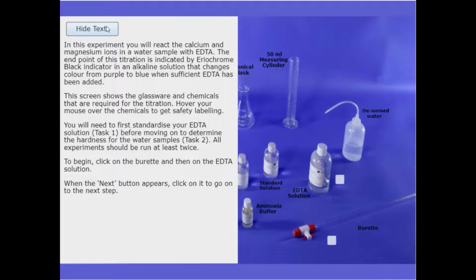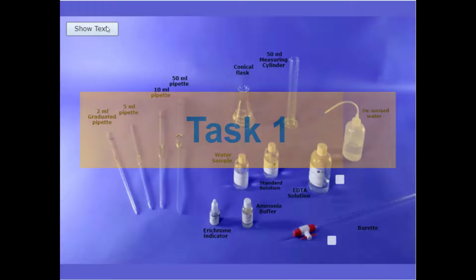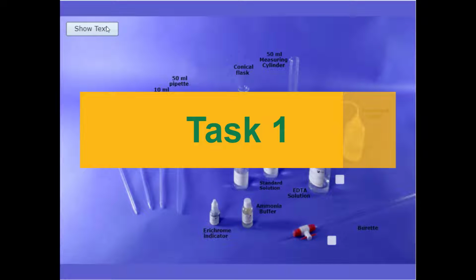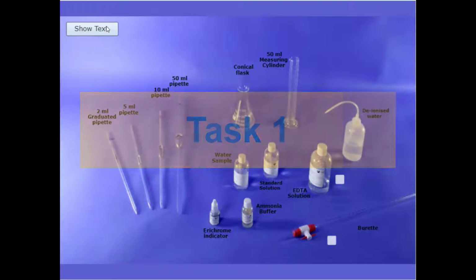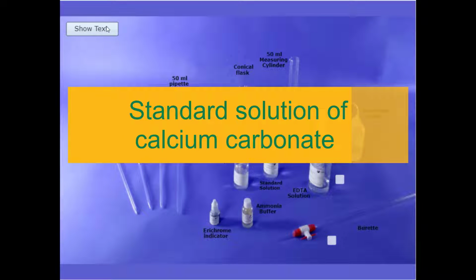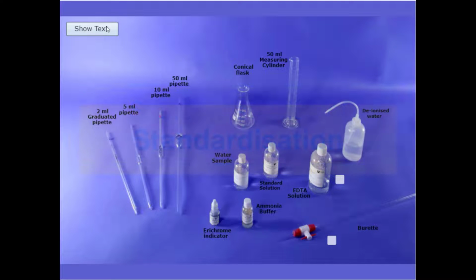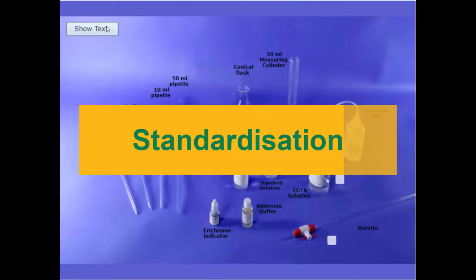It is very important when carrying out this virtual titration that you select items in the order given in the instructions. Your first task, task 1, is to determine the exact concentration of EDTA by reacting with a standard solution of calcium carbonate of a known concentration. In this case, the concentration is 0.01 moles per liter. This process is called standardization.